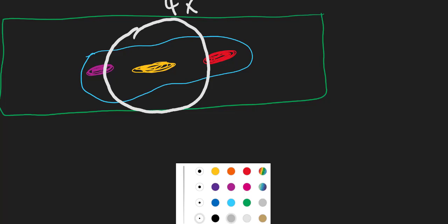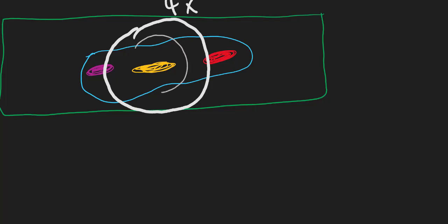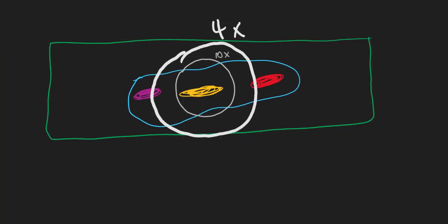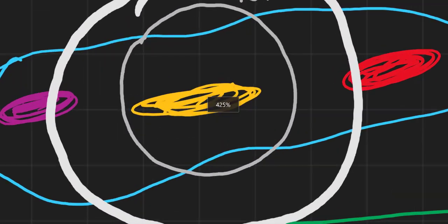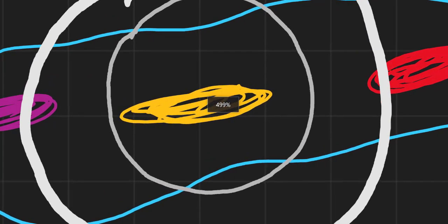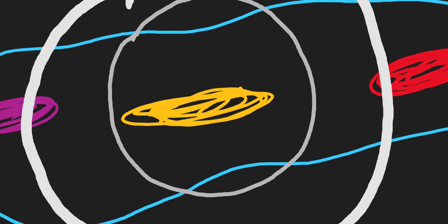That would zoom in, it would magnify the image, so we'd get a much closer look, say, at this little yellow guy using the 10x objective lens. But notice we're seeing a lot less of the total slide overall. We are only now seeing this area inside this innermost gray circle, right? That's what happens when you increase magnification.